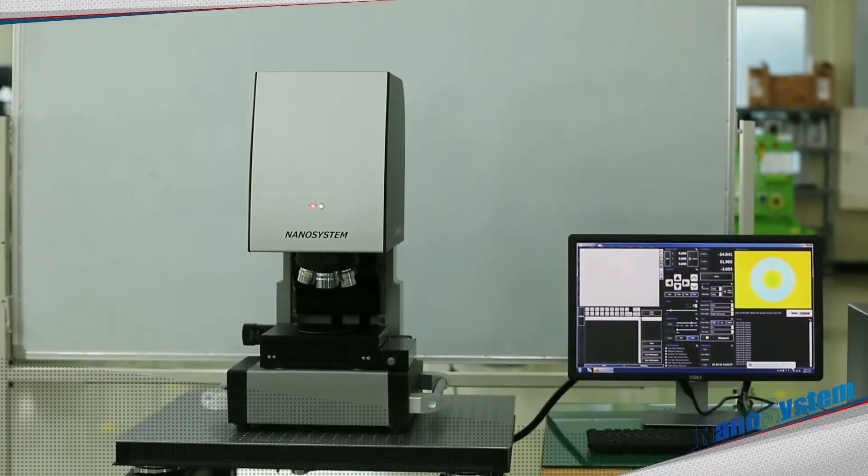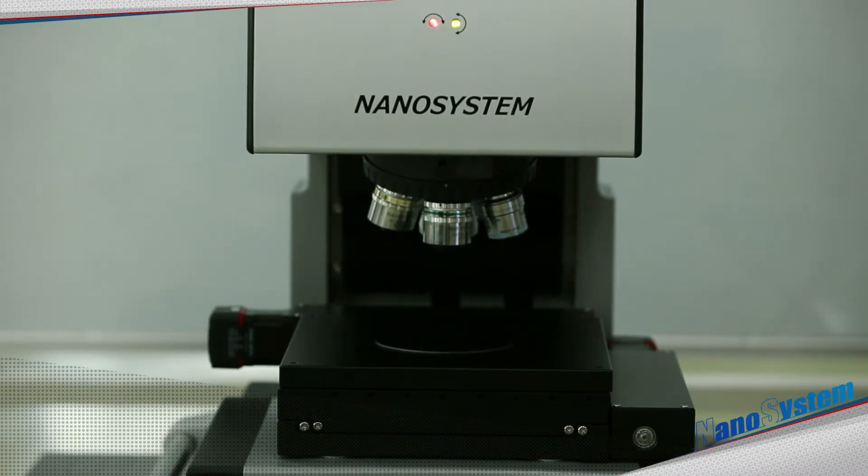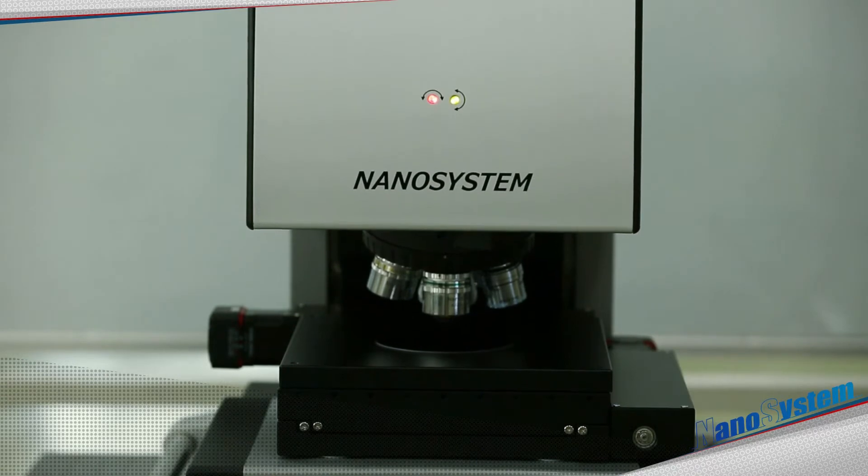WSI, White Light Scanning Interferometry, is the technology for measuring surface area, height and volume with high resolution and high speed.